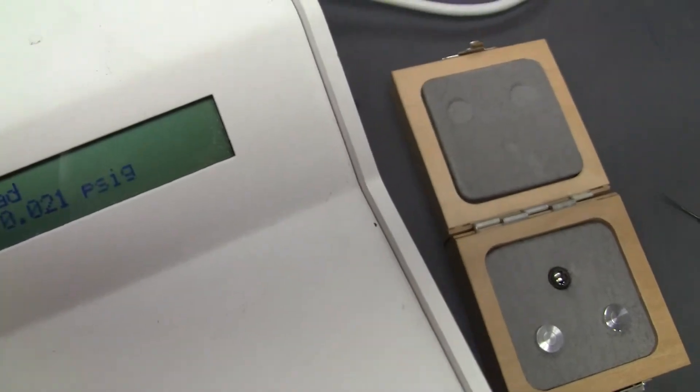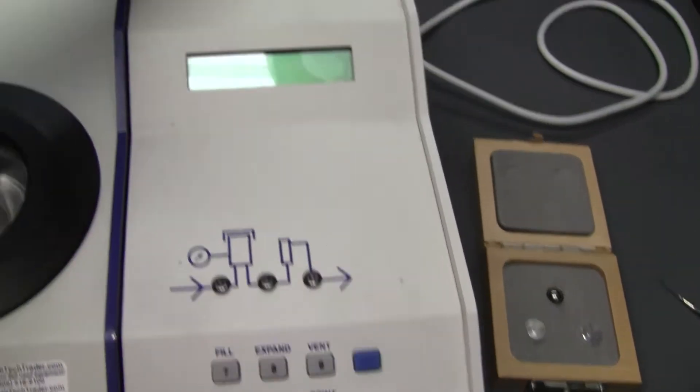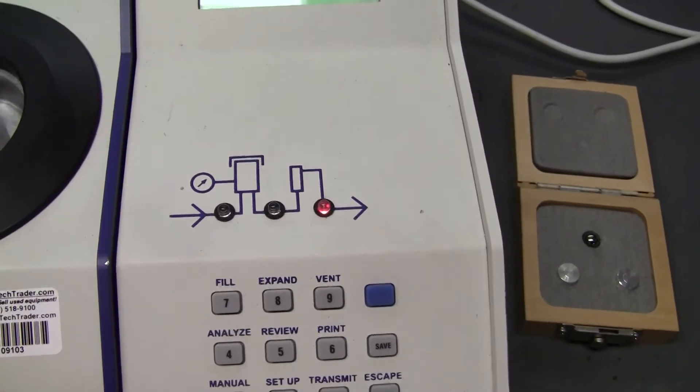In the start-up, I'll just go through the start-up procedure here. You watch the instrument initialize. Some lights.